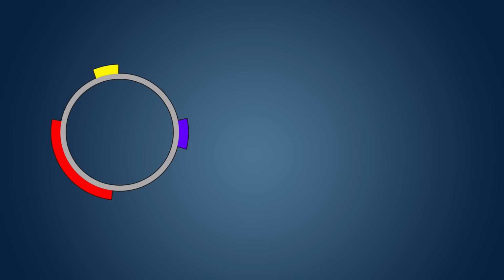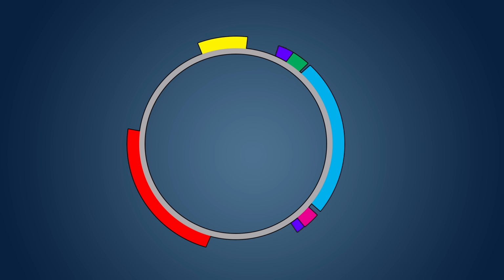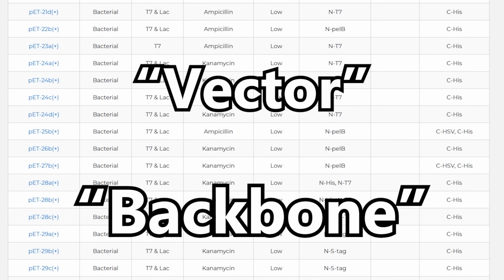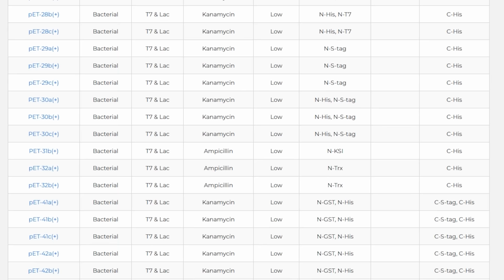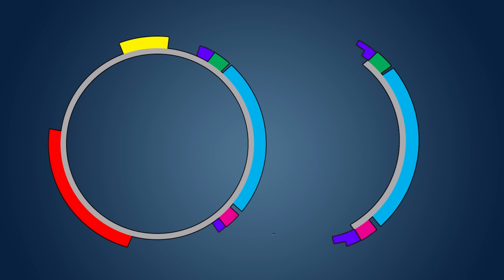The MCS is a spot where it's been purposely made very easy to pop the DNA open and slot in a new piece. This way, you don't have to print the whole plasmid each time, only a tiny little piece, and you choose what's called the vector or backbone according to your preferences and needs. Most of my plasmids are based around a vector called PET9A. It's a low-copy kanamycin carrying backbone, so all we need to do now is design the piece we slot in.